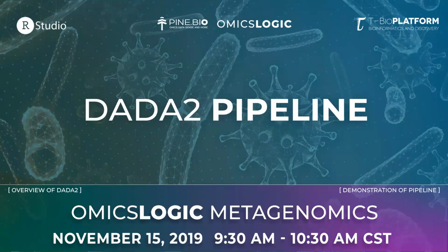So today we want to continue and explore the DADA2 pipeline. And the DADA2 pipeline really was designed to address several of the challenges related to analysis of data where we have the amplicon 16S gene, but only the hypervariable regions. So let's review again, what are these regions and what are some of the challenges that arise from sequencing just that data.